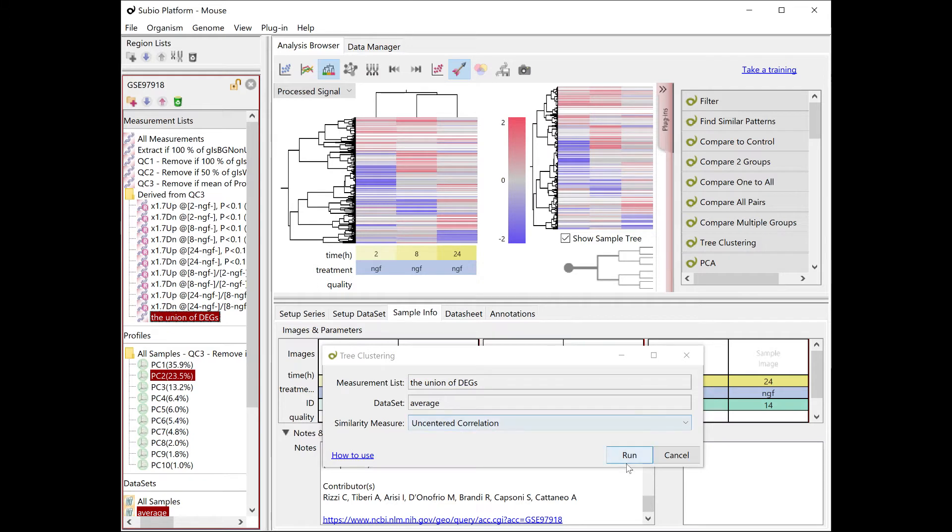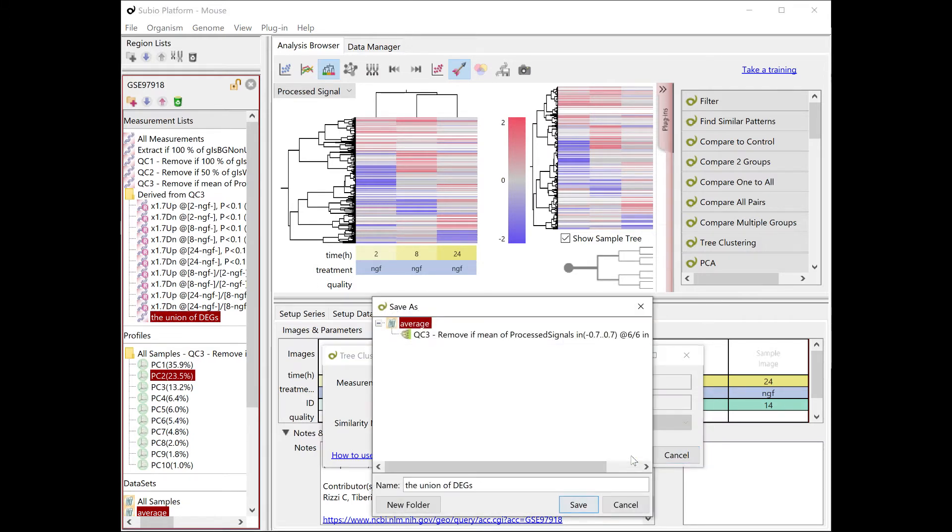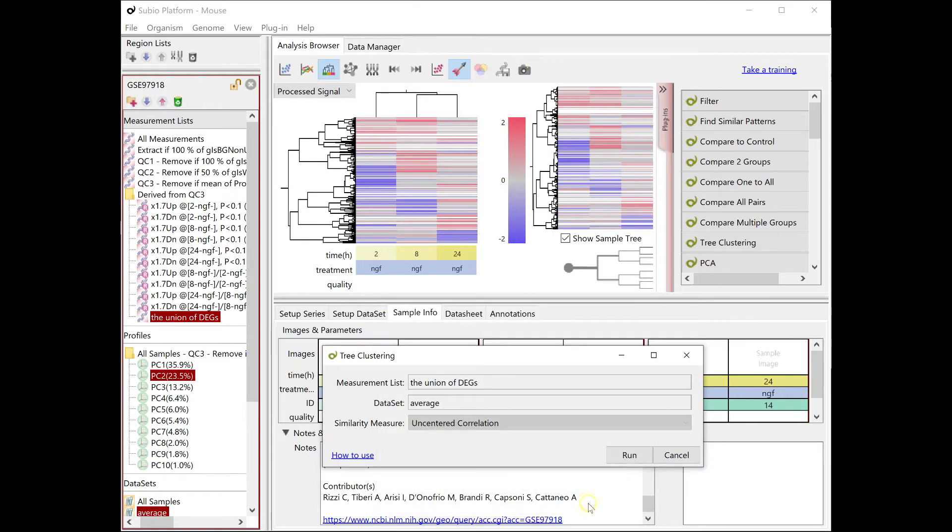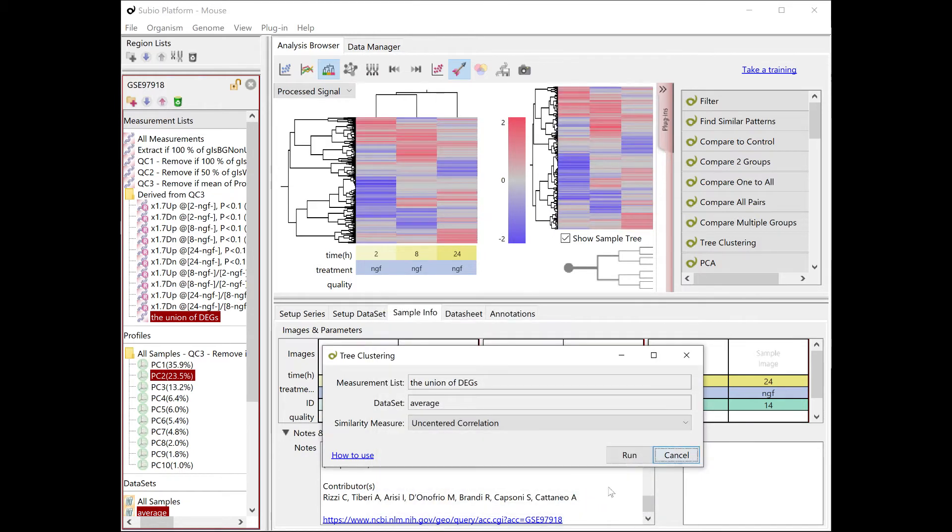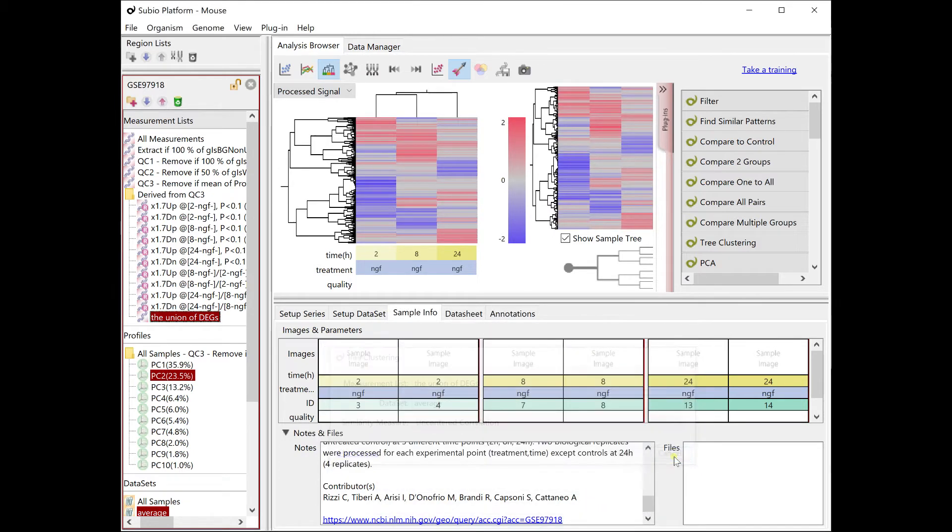Next, we do clustering again, but with the union of DEGs list. The absence of ambiguous genes gives the heat map a vividness in color.